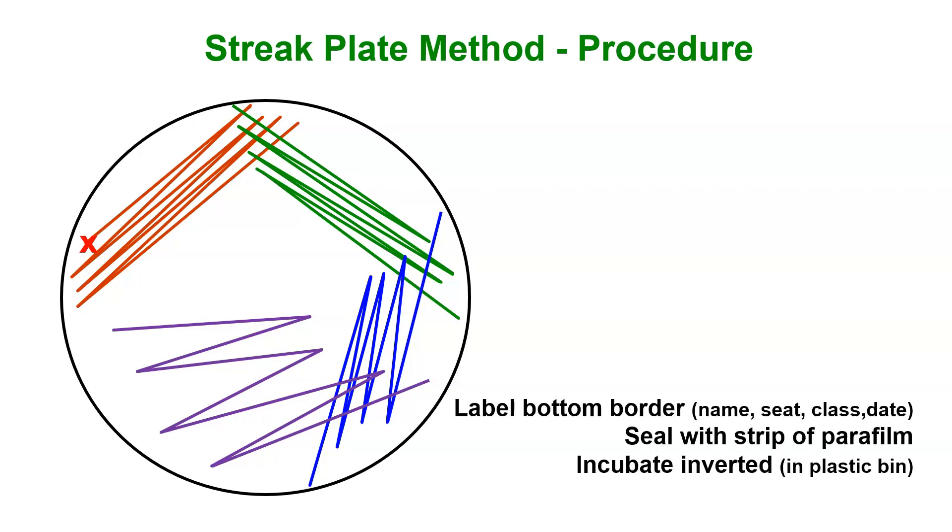You label it. You're going to put your name, your seat, your class, your date. You're going to seal it with a strip of parafilm. You're going to incubate it inverted in the incubator.